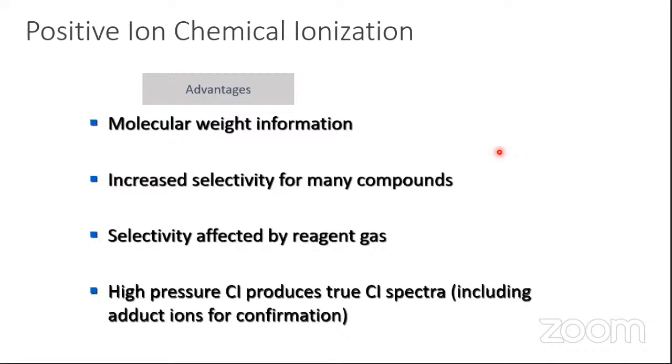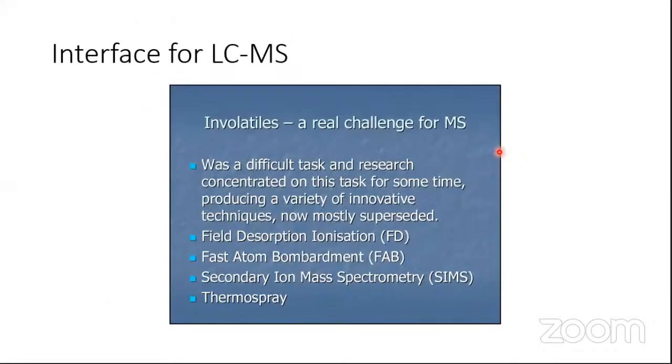Now we quickly go to LCMS. With LC we do the analysis of non-volatiles or thermally labile compounds. GC is used for compounds which can be vaporized. There is a main difference between these two techniques: GC can be used for only 10% of known organic compounds, while LC can be used for more than 90% of organic compounds. So if GCMS can do this, LCMS should also be able to do a much better job.